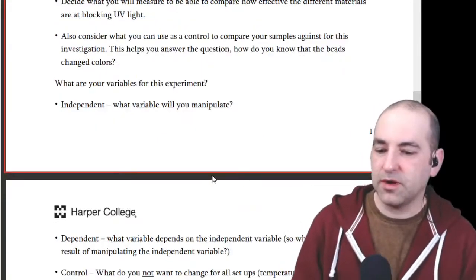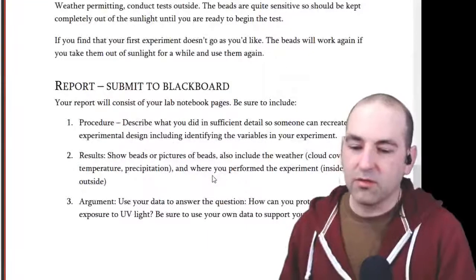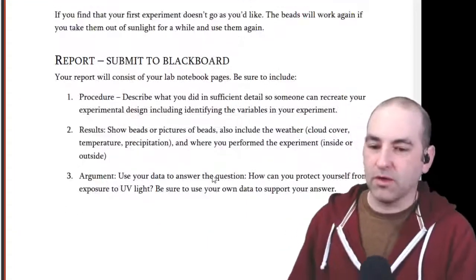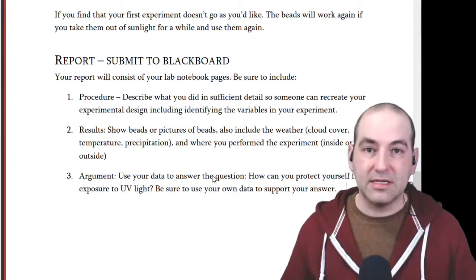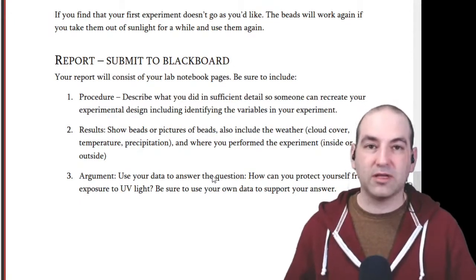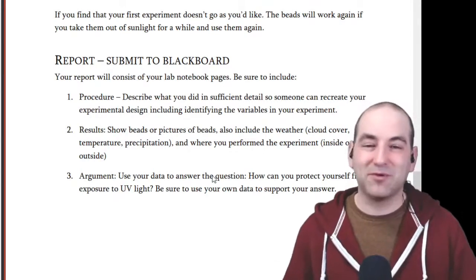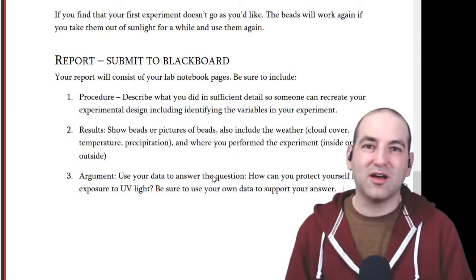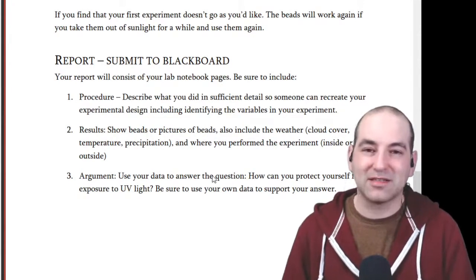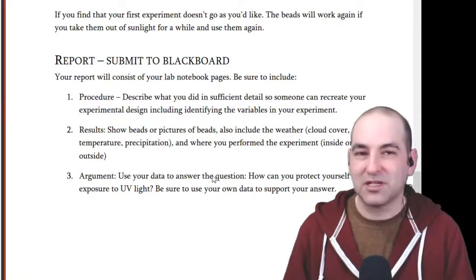All right, so once you have gotten that under control, the report should be pretty straightforward. You've got this whole procedure worked out now. Describe it in detail, enough detail that someone else who's not you can reproduce your results. And ideally, test that. Find someone else and see if they can get your results. I know in this current situation, some of you don't have access to other people at the moment, but it's just an idea if you can do it.